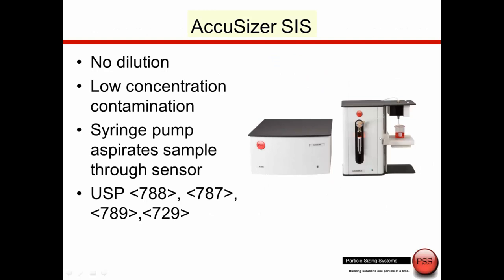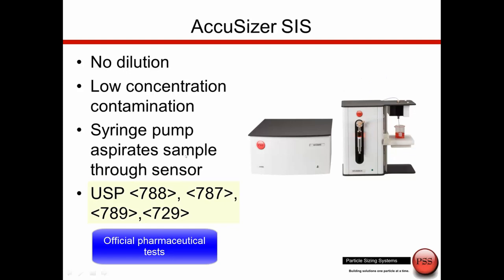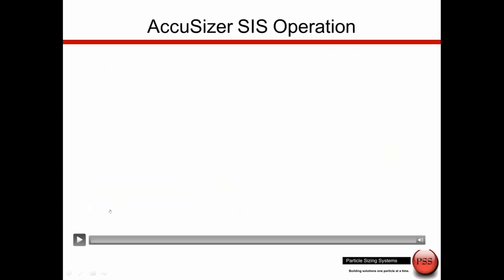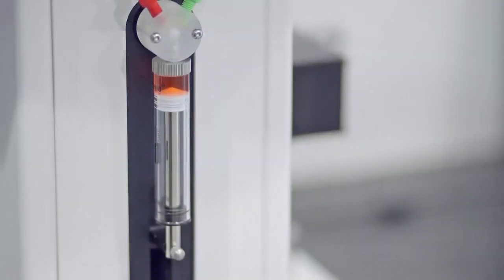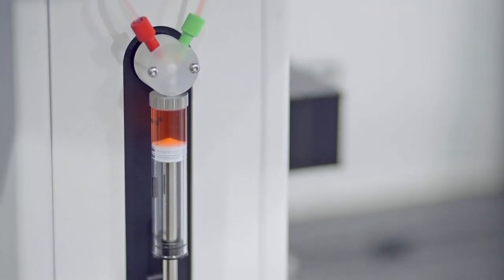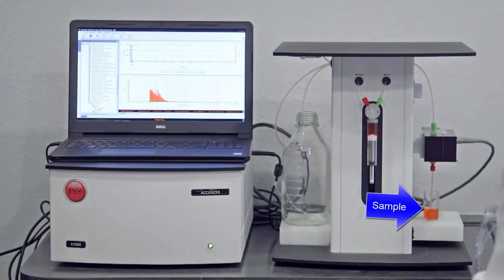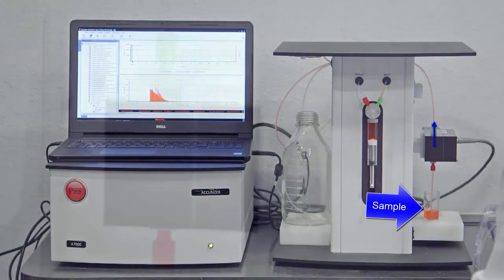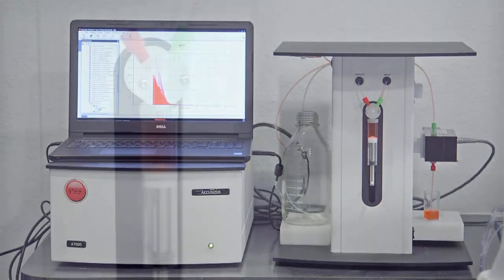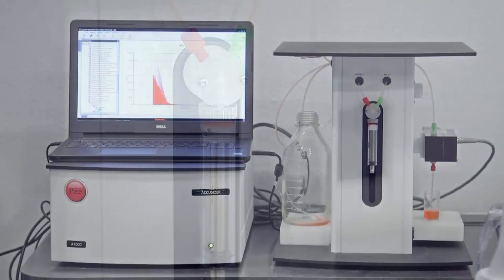This is the AccuSizer SIS, the syringe sampler. The sample is placed here and the syringe pump aspirates it up through the sensor. In this short video, you can see the syringe pump pulling down, moving the sample up through the sensor where the measurement is made. Then the syringe pump reverses and pumps the sample out to drain. This is the preferred system for many USP tests performed in the pharmaceutical industry.